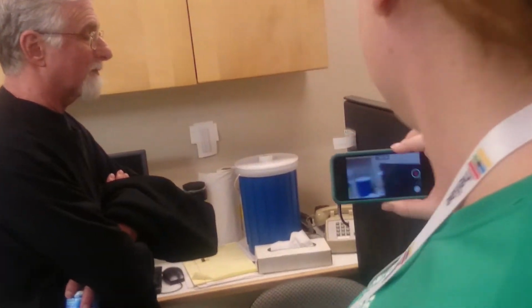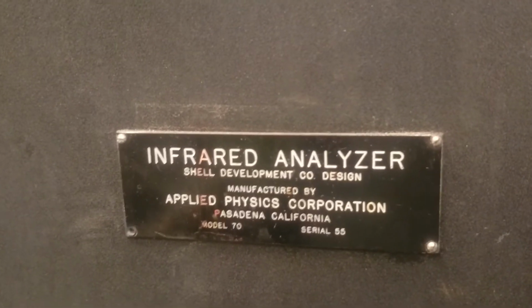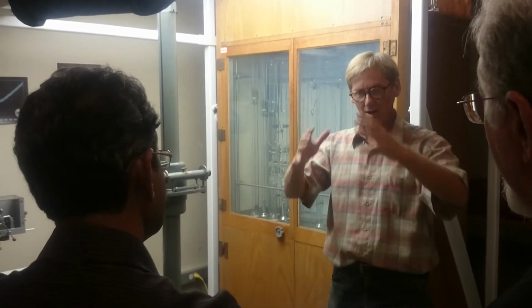And let me talk first about the manometer. So this was not the manometer at Caltech. This was a much more carefully engineered manometer that he built in the first few years he was here, starting about 1958. So this is the basis for us knowing that the carbon dioxide concentration in the atmosphere really was around 310 parts per million back when he started measuring. So this is designed to give you an absolute number, 310 parts per million. That guy over there only tells you that one sample is different than another sample. That's a differential instrument. So that needed a calibration. But if you could establish this to calibrate the air in a high pressure cylinder and then use that to calibrate that, then you scale up. So that was the overall concept.